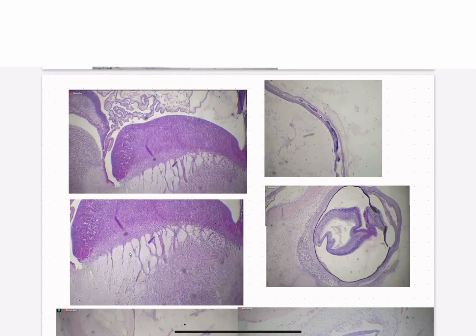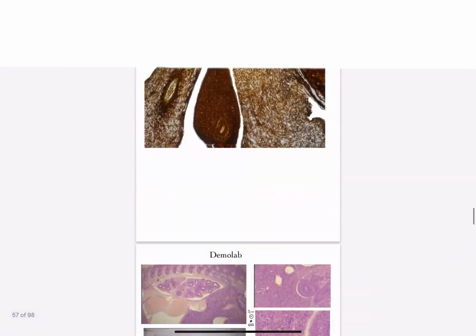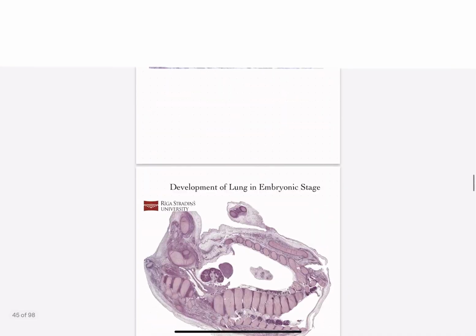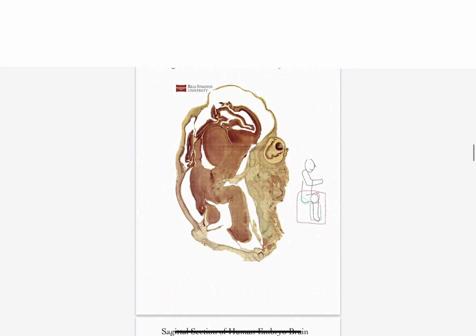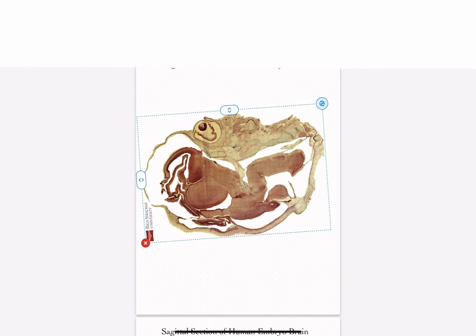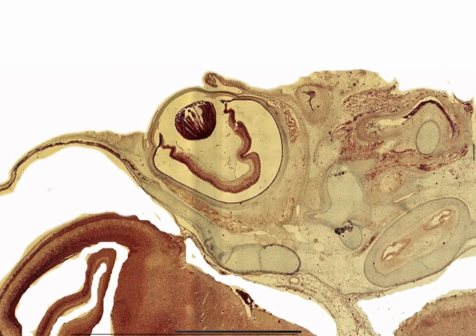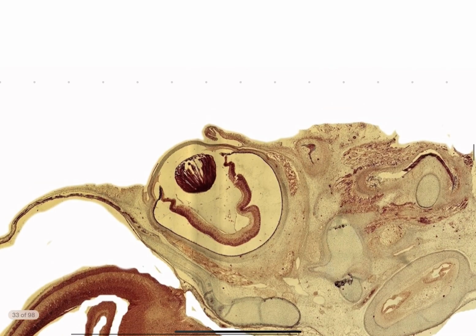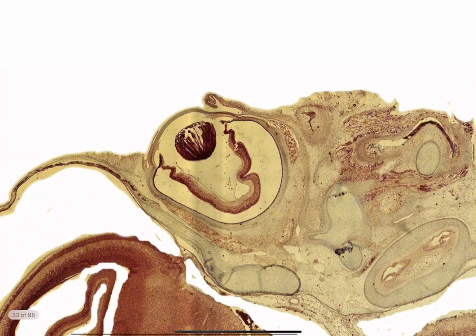Let's talk about what it would look like if this slide were to be upside down, for example. So let's zoom up, and we see the slide being to the side, maybe something like this, right? Now here we can still see that the eye is very much visible, and the outside of the eye, or the empty space, is towards the top of the eye. So this has been sort of moved at a 90-degree angle.